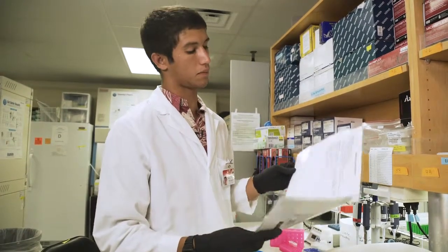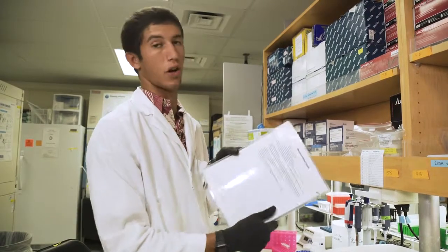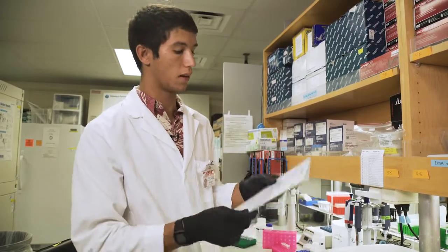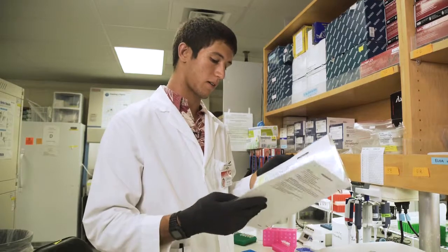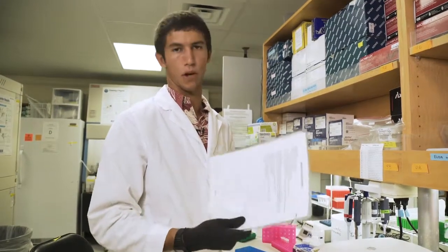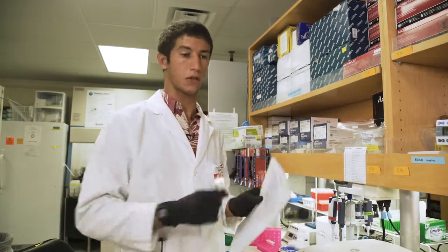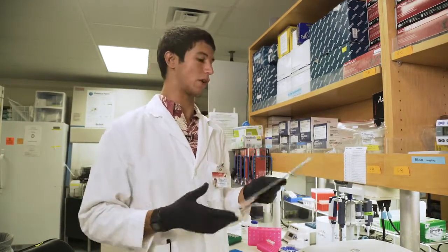It's just take it out, dump it. And then once we've dumped it, we'll be adding the second wash buffer called AW2. The first wash buffer removes proteins we don't want. The second wash buffer removes salts. So proteins are a lot bigger, salts are real small, just individual molecules.